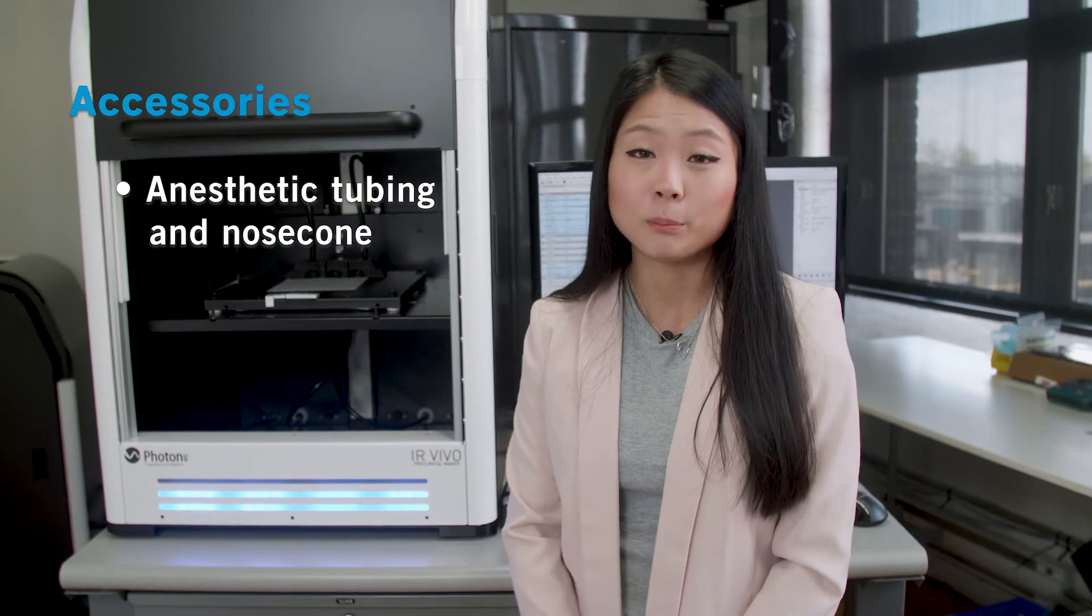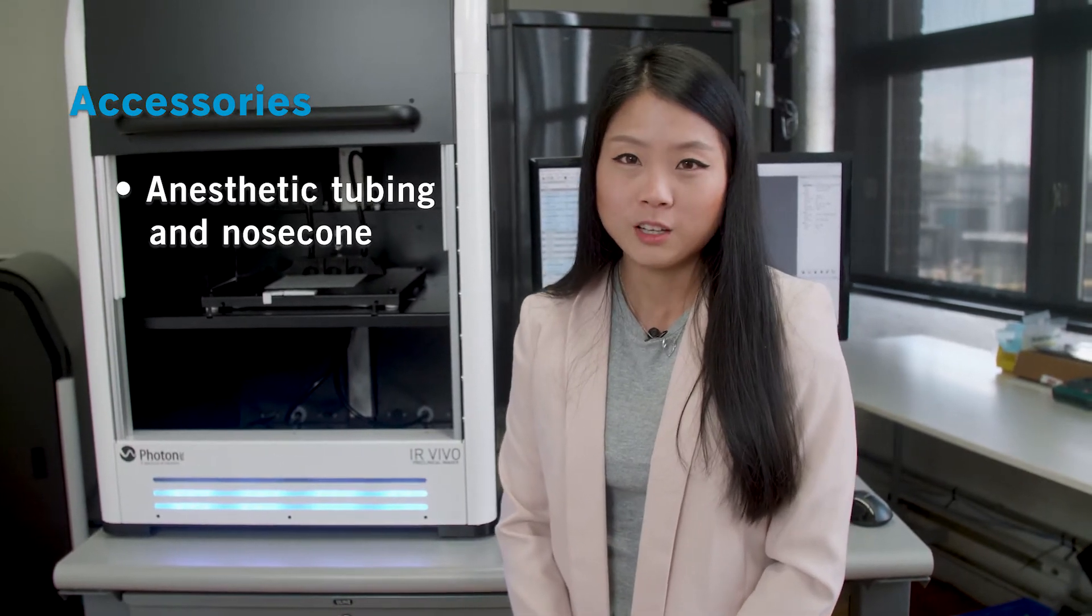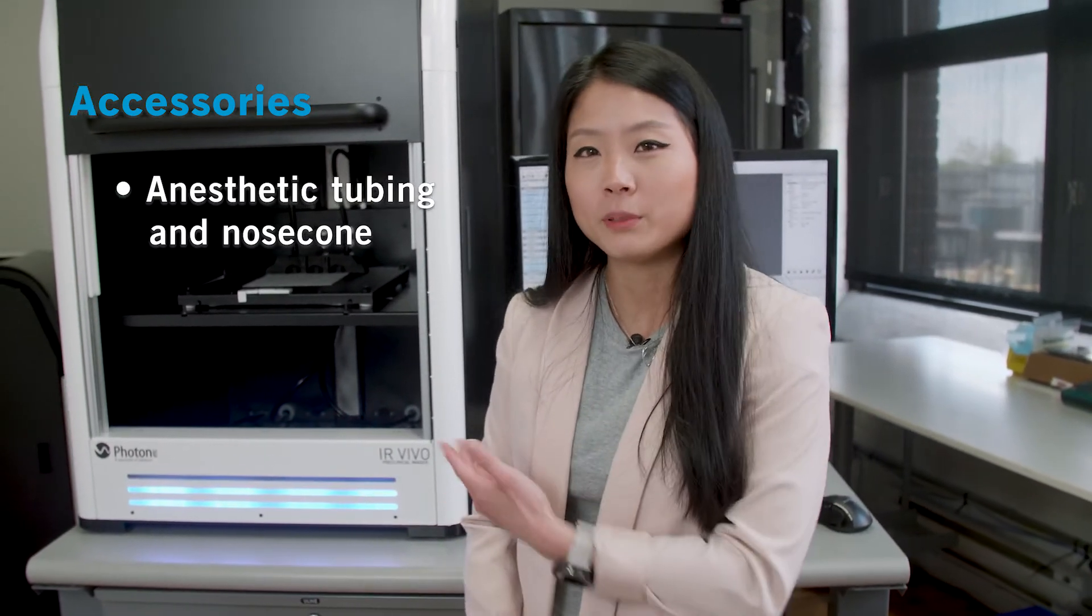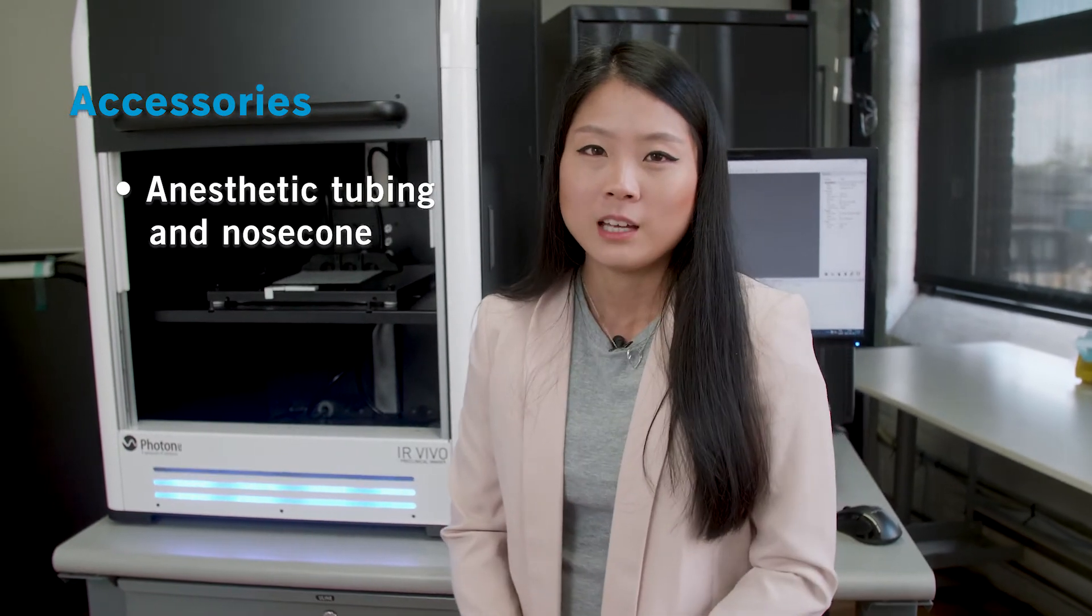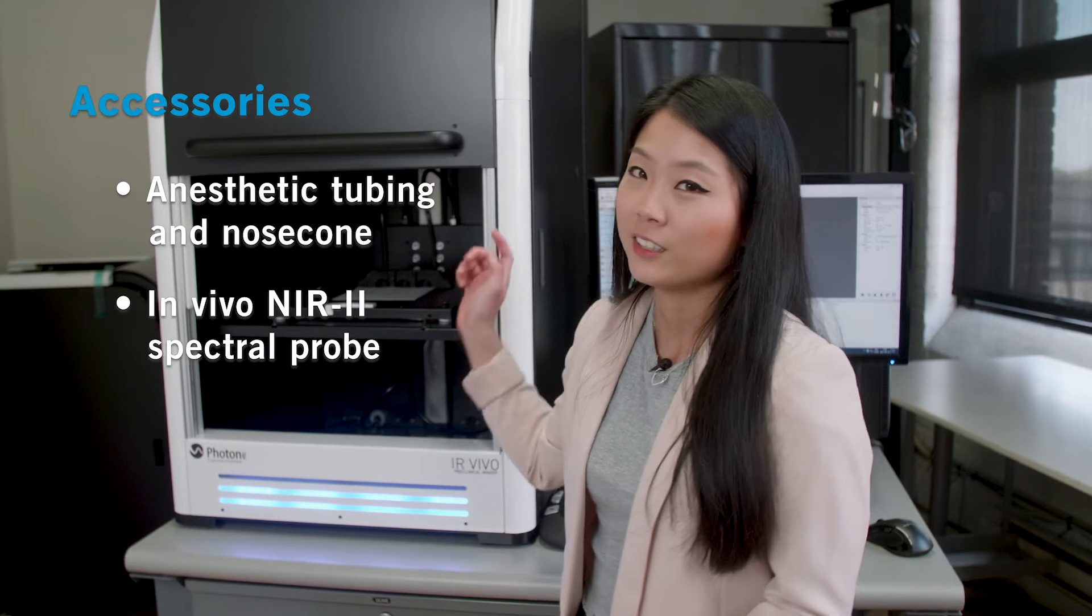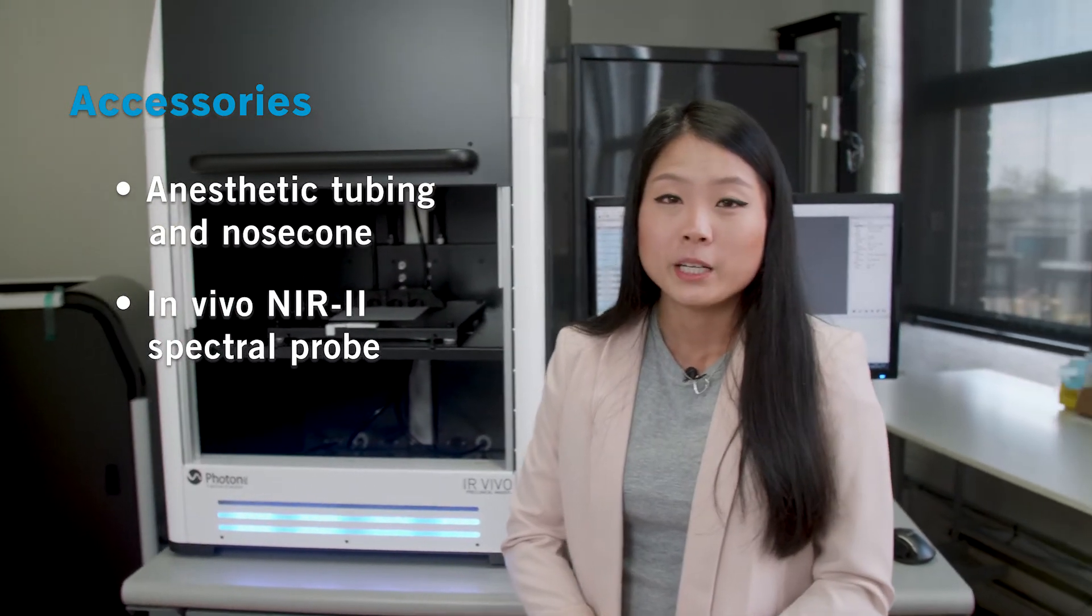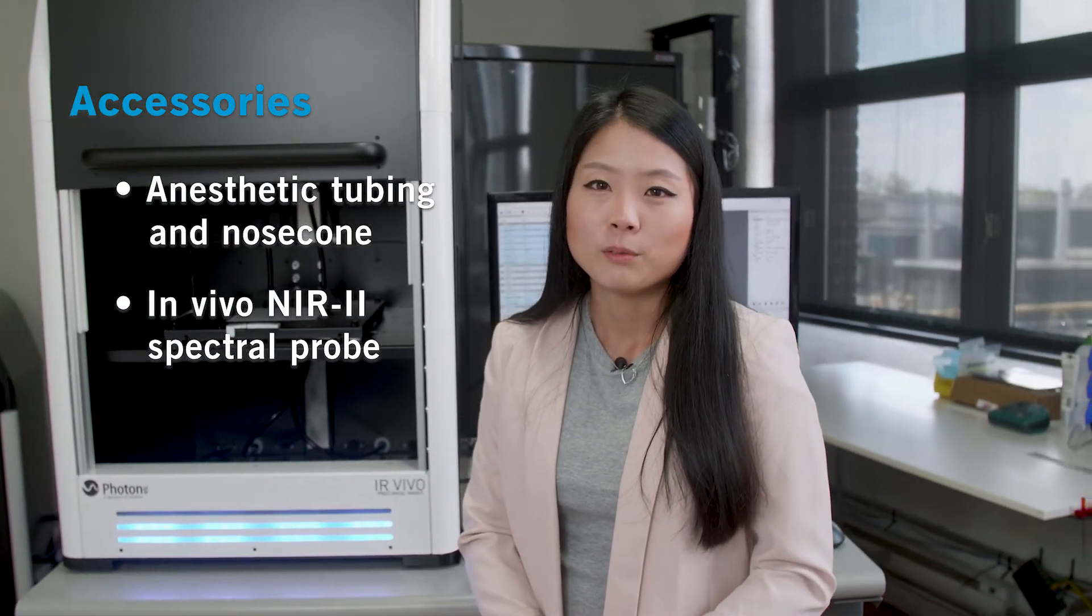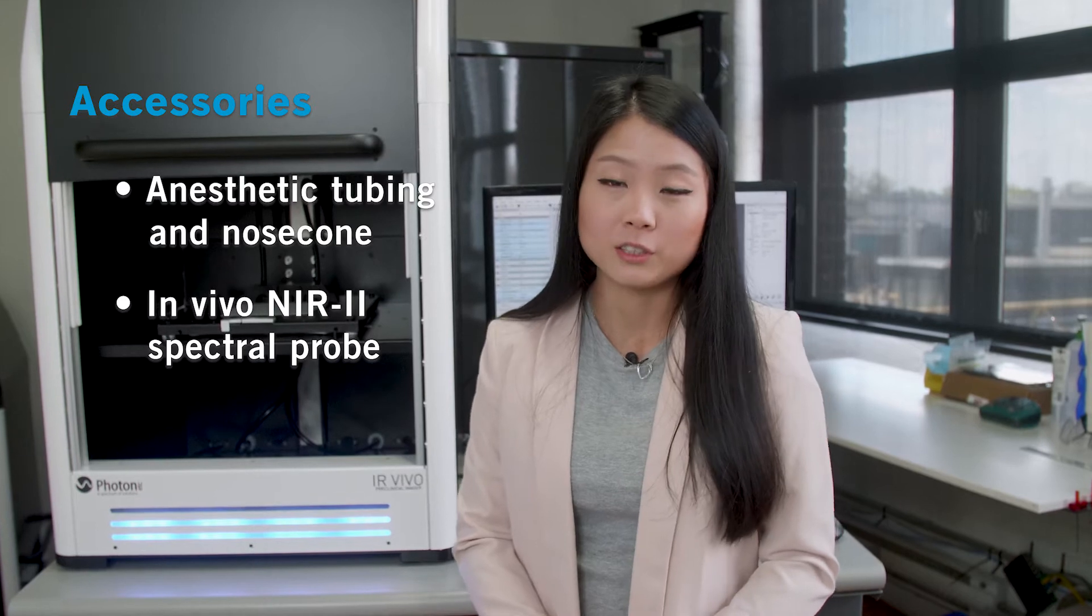You can have two different accessories with the iRevivo. The first one is the anesthesia system that's coupled to a nose cone. If you have yours, we can simply integrate yours. And the second accessory is the spectral probe inside the system. It's meant to extract a spectrum from a specific part of the mouse in real time.